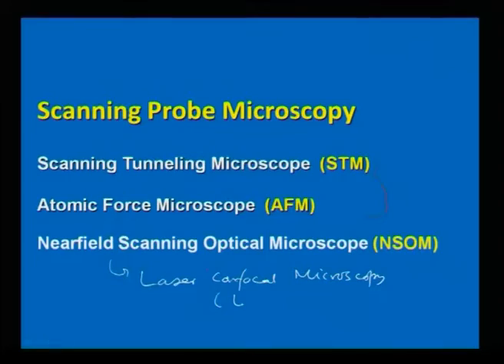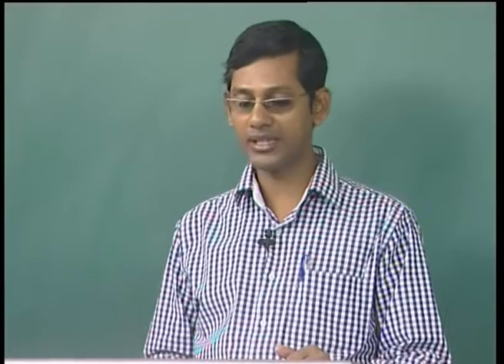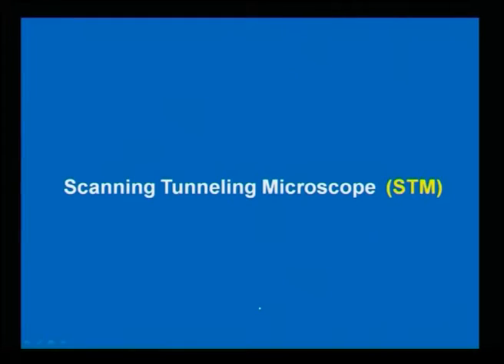So, in this lecture, we are going to discuss these three techniques one by one: STM, AFM, and NSOM. And part of the NSOM is basically LCM, that is laser confocal microscopy. So, let us first discuss scanning tunneling microscopy.